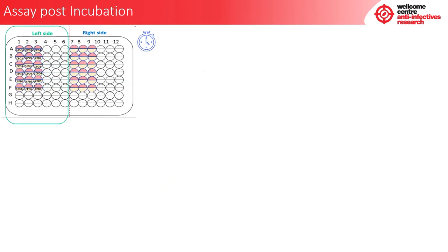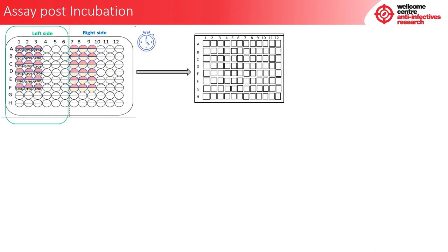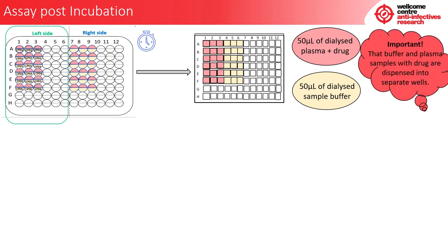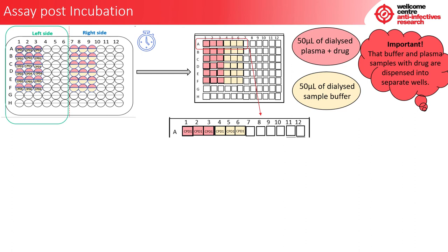Once the protein check has been carried out, post-incubation sampling can occur. Into a fresh 96-well 2 ml deepwell block, add 50 microlitres of dialyzed plasma and drug into columns 1 to 3, then add 50 microlitres of dialyzed sample buffer into columns 4 to 6 for all compounds. It is important that the buffer and plasma samples with drug are dispensed into separate wells. For example, for row A: columns 1 to 3 have the dialyzed plasma and drug samples for compound 1, and columns 4 to 6 have the dialyzed buffer samples also for compound 1.